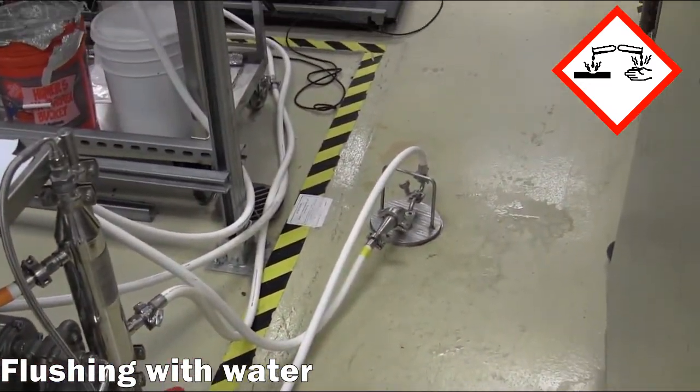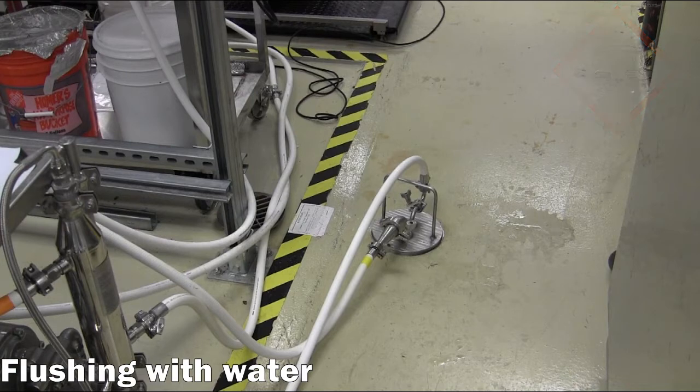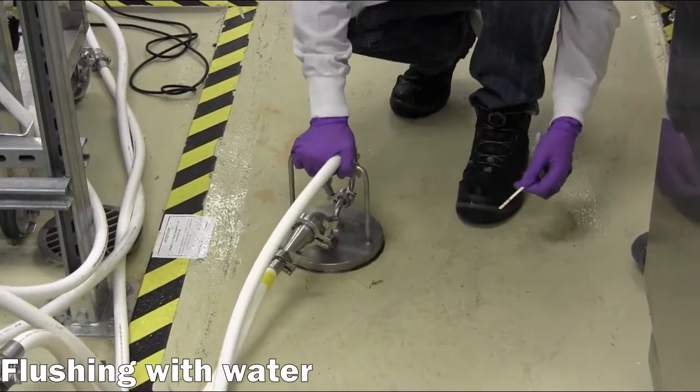The caustic solution will be gradually flushed out until a neutral pH is reached on the permeate outlet stream, as measured with a pH test strip or pH meter.